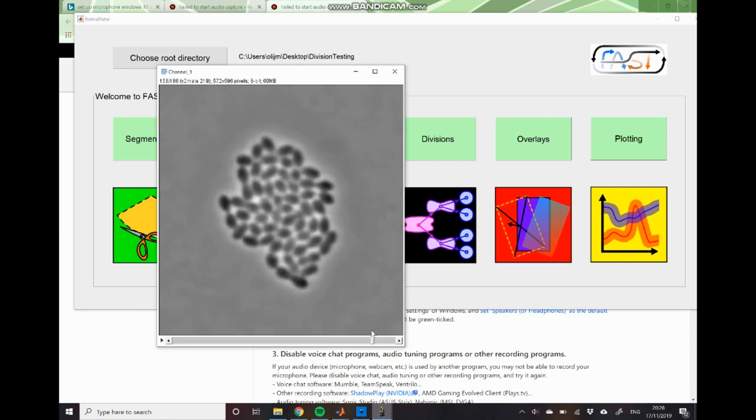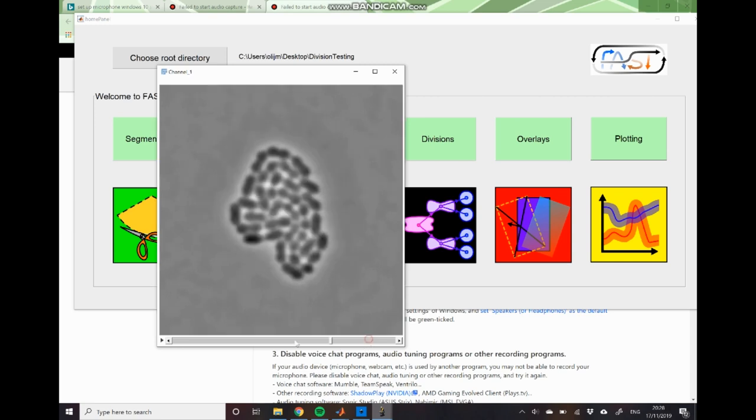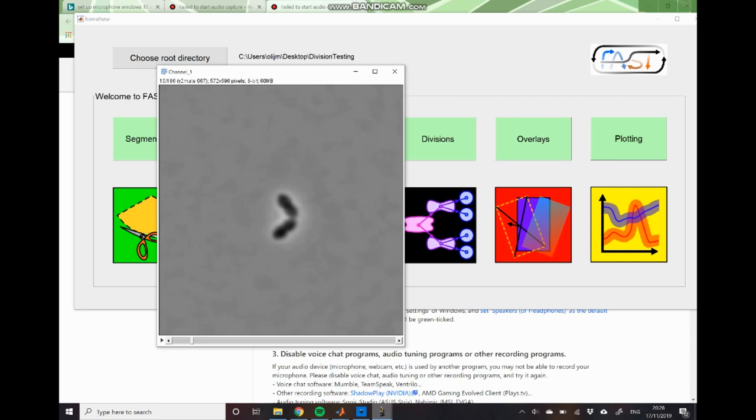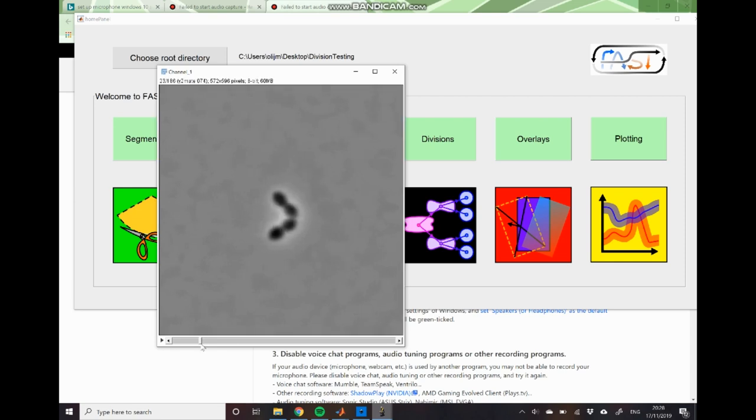So the goal of division detection is essentially to assign each of the cells in this final microcolony to one of these two mother cells in the initial time point. Essentially we want to create a lineage of each of the descendants of these two mother cells.